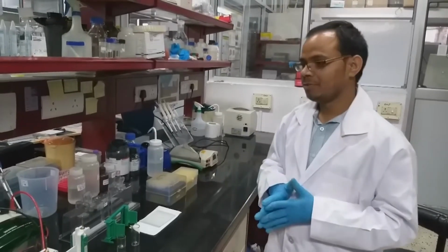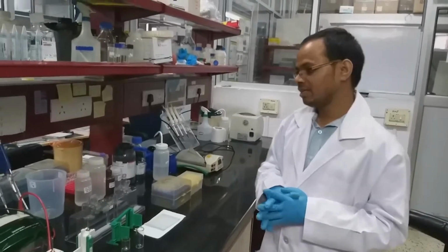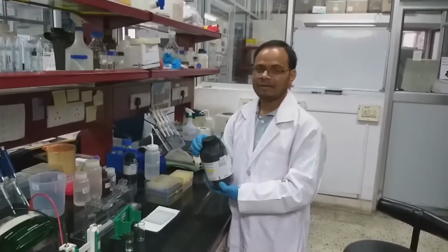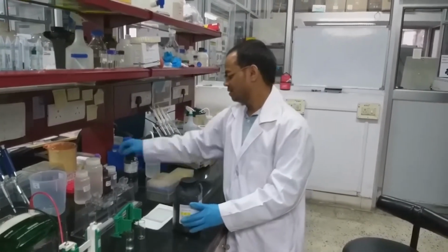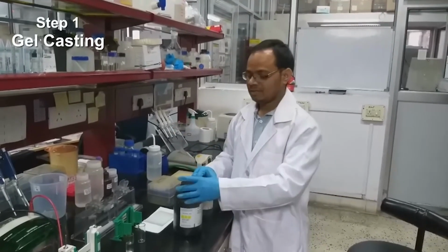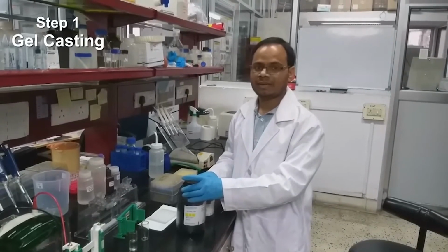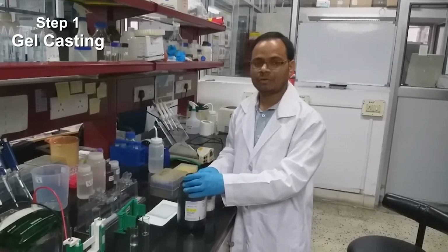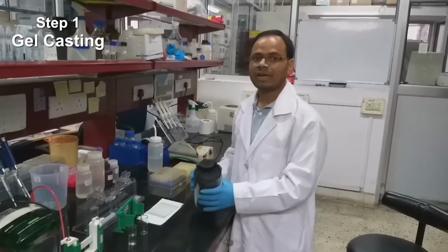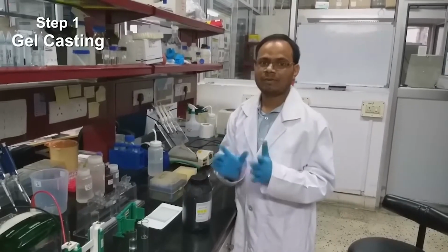Generally we prepare 30% acrylamide. 30% means 29 grams of acrylamide and 1 gram of bisacrylamide, a 29:1 ratio, in 100 ml of water. Both of these are neurotoxic, so we have to always wear gloves.